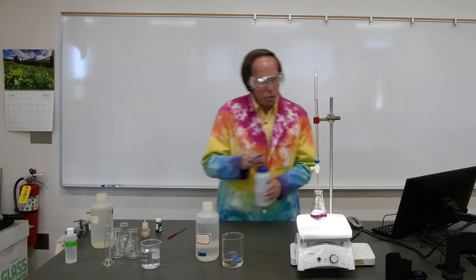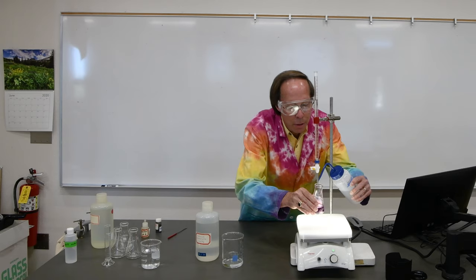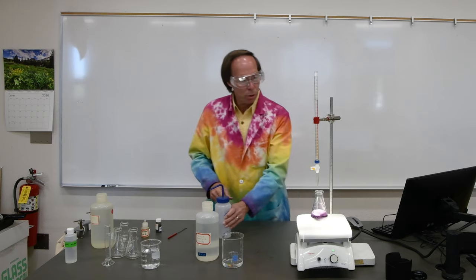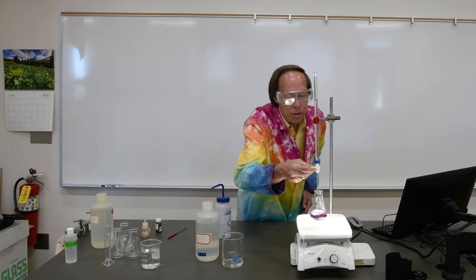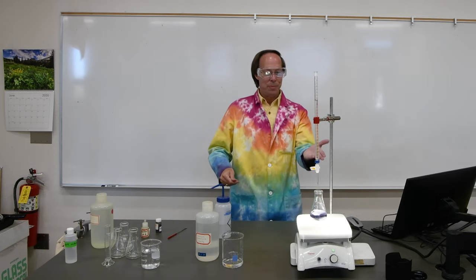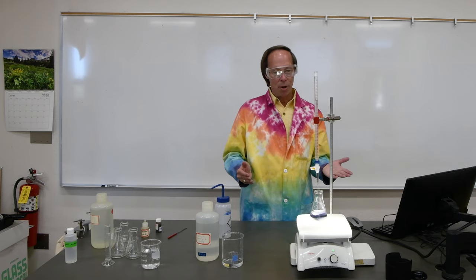In fact, there's a droplet on the end of the burette. I'm going to shoot that down into the flask and see if that's enough to get it blue. It looks like it wasn't quite enough. We need about one more drop. So let's try to add a single drop of EDTA. All right, let's see if that was enough. And lo and behold, it turns that lovely blue color. And that means that we are at the end of our titration.